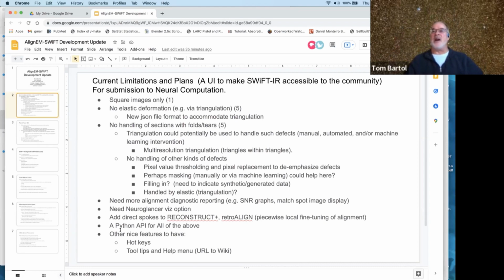So the ZAR format: you have a stack of images and you point at the images and you say, make the ZAR with a button press in the alignEM-SWiFT GUI, perhaps. And that makes a copy of your scale 1 images, brings it into the ZAR, and then makes all the other scales of images, and puts it in this ZAR container format.